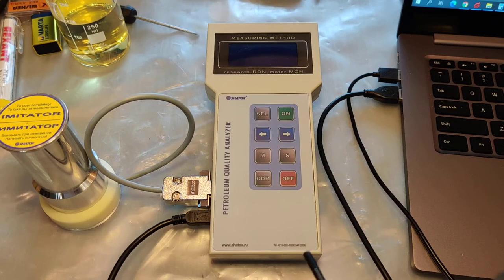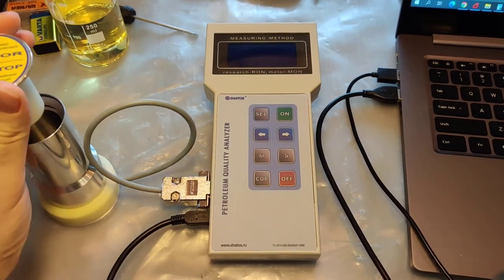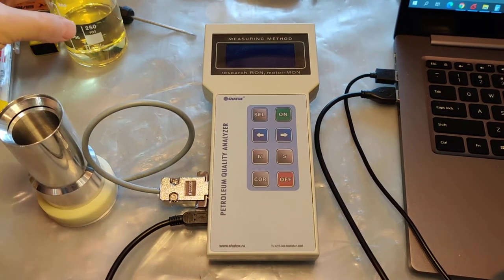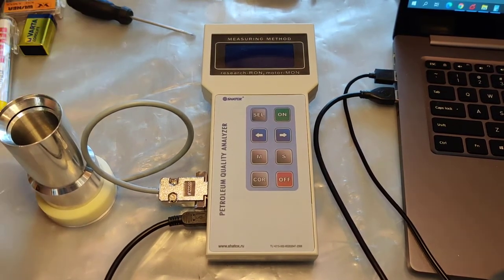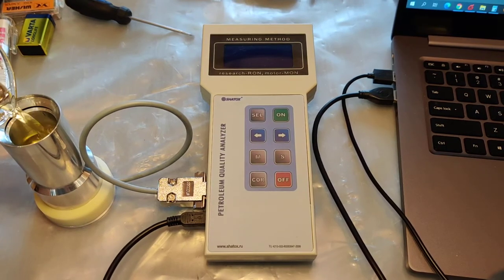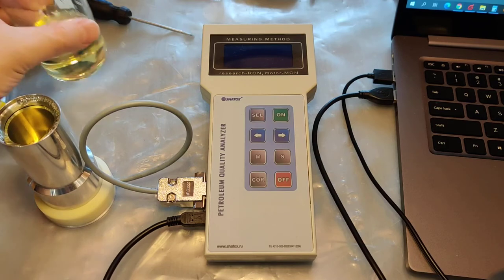Now we are going to test a gasoline sample with it. I remove the imitator plug from the sensor, and pour gasoline inside the sensor until it's completely full, till the very brink.